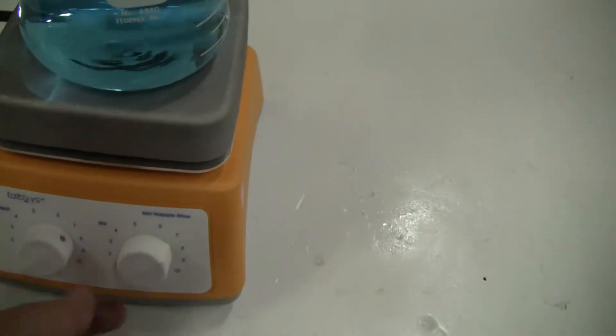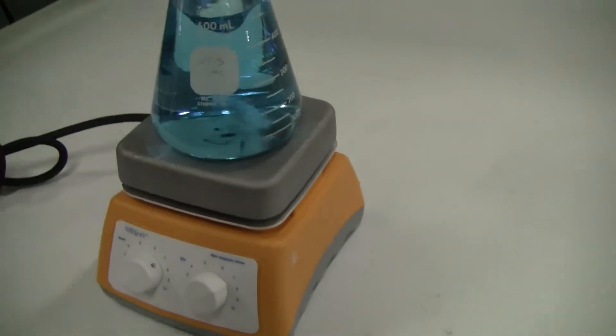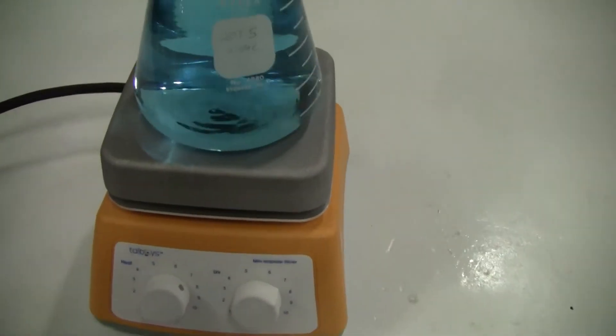Same thing with the stirring. 1 to 10. How fast do you want it to spin? Full power is 10. And then turn it off. Complete on-off in the back. Nice molded stand holder right there.